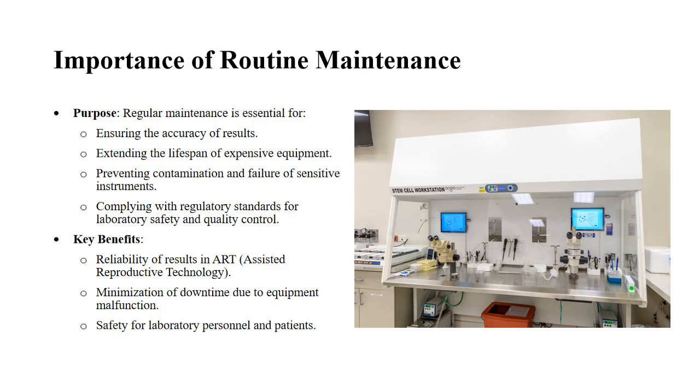1. Importance of routine maintenance. Routine maintenance is essential to ensure accuracy and reliability. Calibration ensures that instruments perform to their expected standards. Longevity: proper care and regular service extend the lifespan of costly equipment.